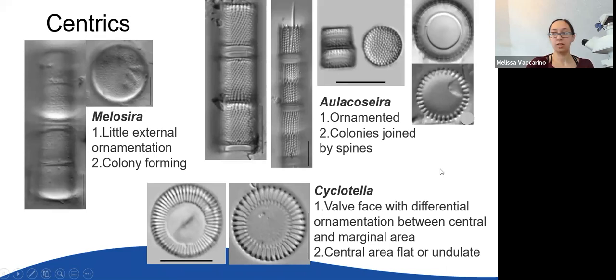Mark, if you have the link from here to get to species on these, you'd want to count the number of striae, the density of the striae for these. And so that's a good reference to use.